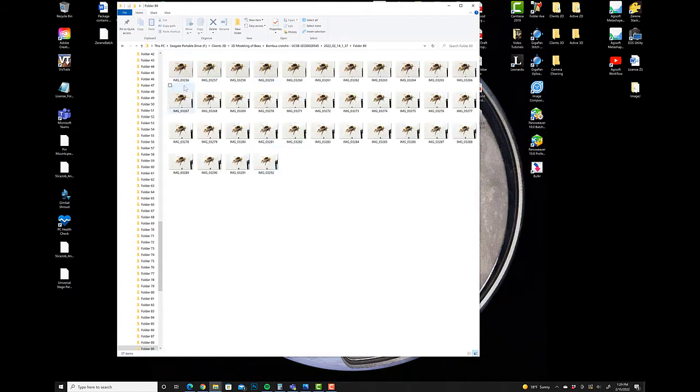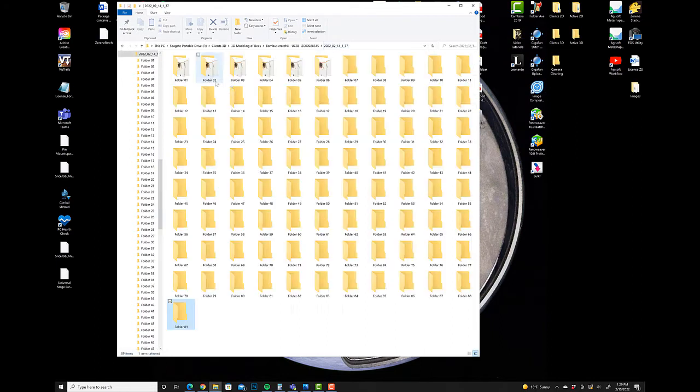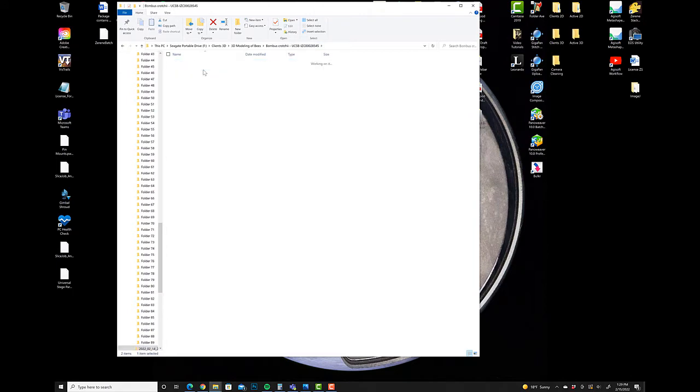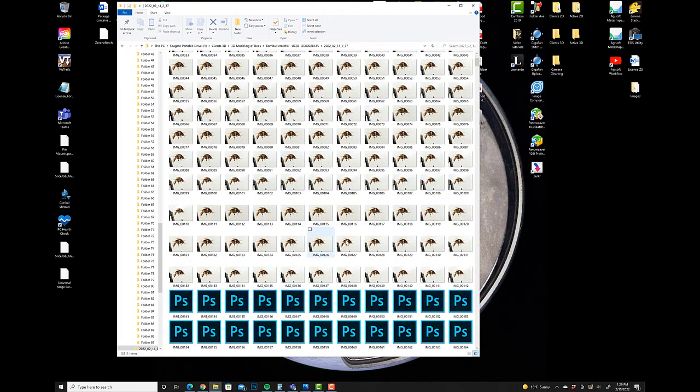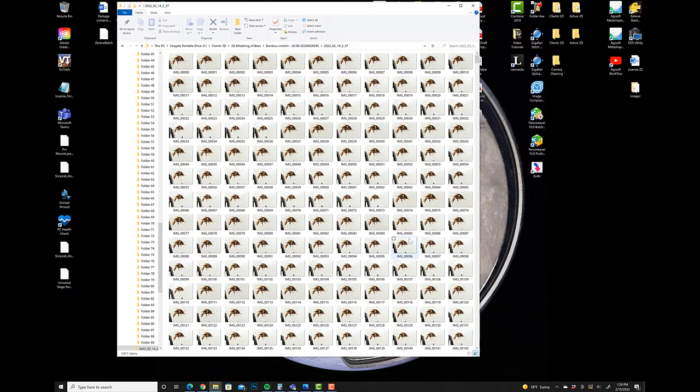You kind of want to double check, just make sure it's always the same angle. This is where resetting the image back to 0 is very important. So here, for example, you'll notice I have this image starting at 0, 0, 0, 0, 0. Now, if this number was starting at 9, 9, 9, 9, 9, then what's going to happen is that first image is going to be captured there, and then it's going to be reset at 0, 0, 0, 0, 1, and the 9 is going to get tucked away at the bottom somewhere, and it's going to mess up the sequence of the folder axe.